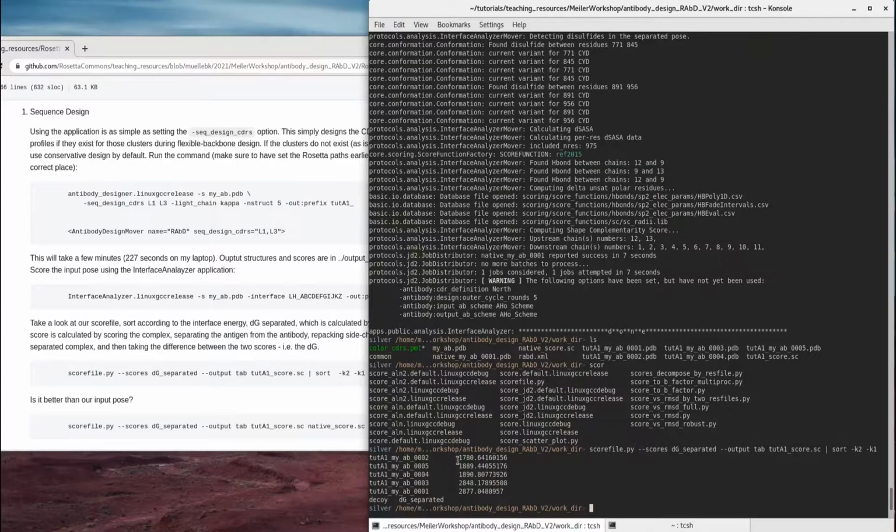But we did very limited design, so it's very hard to tell. So it's obviously difficult to assess how well we've done. And also, we've only generated 5 models. If you were doing this for real, you'd be talking about generating a couple thousand models.